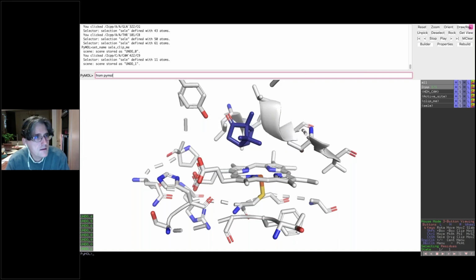I'm guessing here. Old finger memory. Right. And then I could say obj, let's say, I don't know, call it all, equals cmd.get, oh gosh, get all objects, I think, get object. I'm going to have to look that one up.